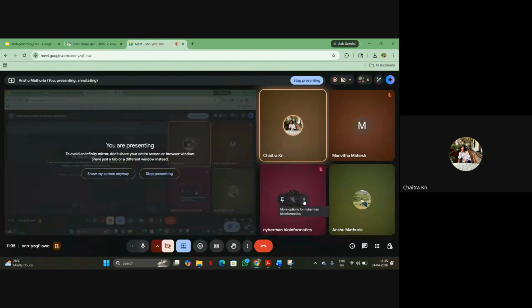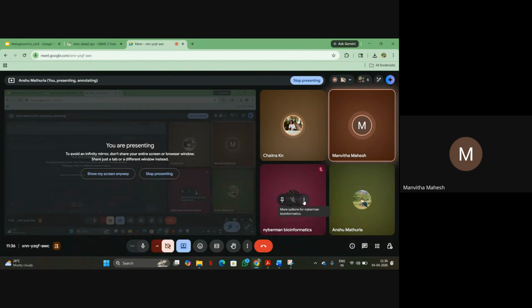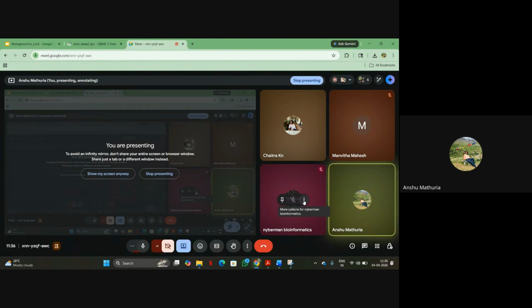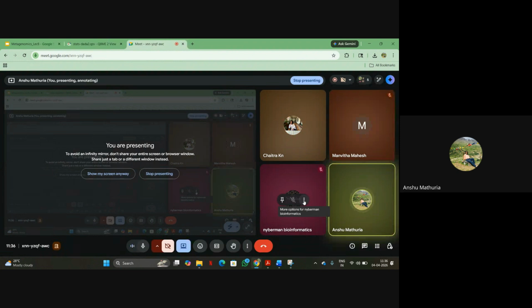Yes, ma'am. Okay. Did your command run? Yes, ma'am. We got the output files. You got the .qzv file as well? Yes, ma'am. Okay. So upload it to view.qiime2.org, and you should also get a similar file. Just upload it simultaneously while we are on the call, so that if it doesn't come like that, then we can work on why it didn't come, but it should come exactly like that. So just upload it and let me know.